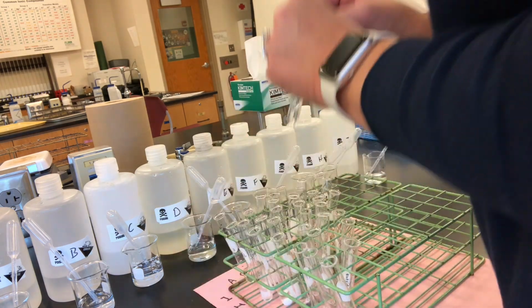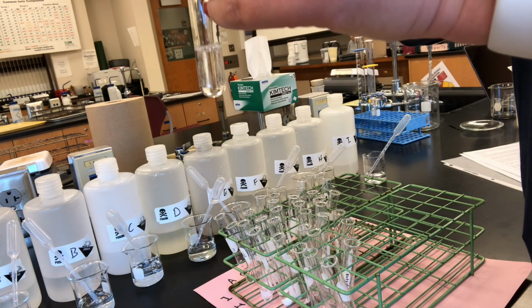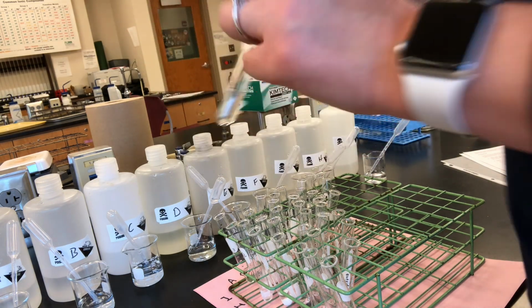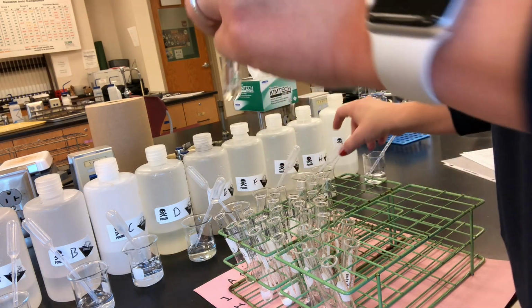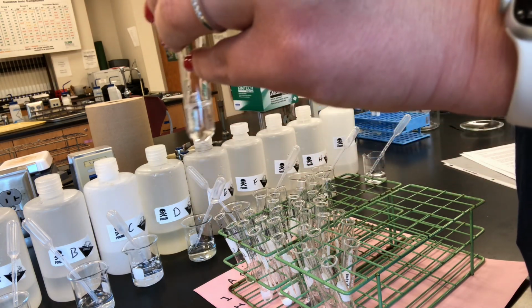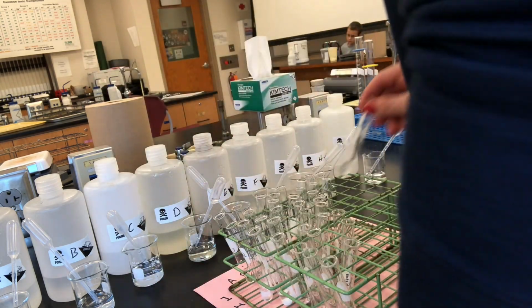F and H: no change. F and G: no change. F and G is no change.